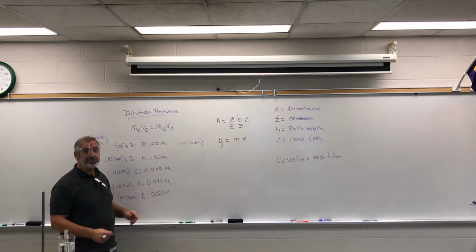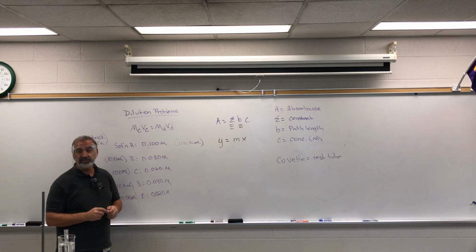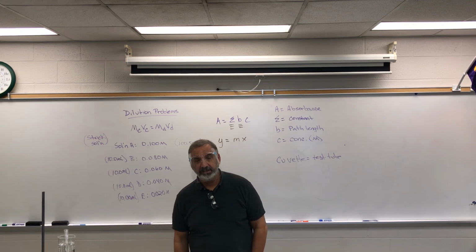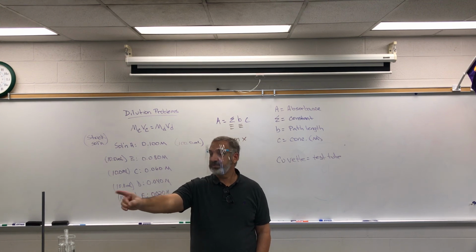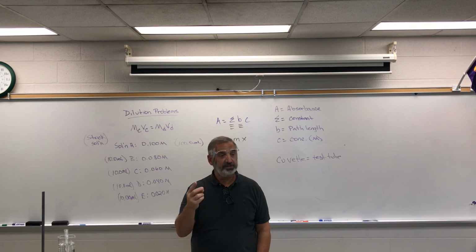Once we have these, then we're just going to put them into our cuvette, and you just drop them into the spectrophotometer, and it reads it automatically, so that part goes super fast. And I'll show you how to use that machine once we get there and are ready to do that. Okay? Now, we have 4 spectrophotometers. We have 5 people. Okay? I'm going to let you two be a group. Just work across the table from one another, but working and making solutions. Everybody else is going to work on their own. And you'll have your own spectrophotometer, you have your own setup, and I'll show you once we get in there how to do that.